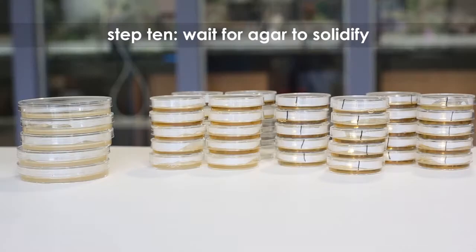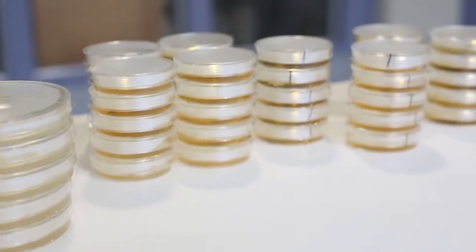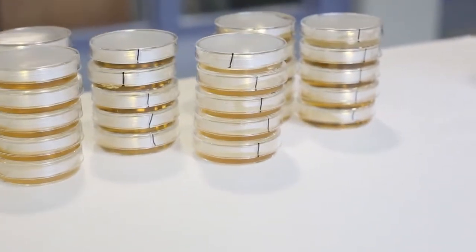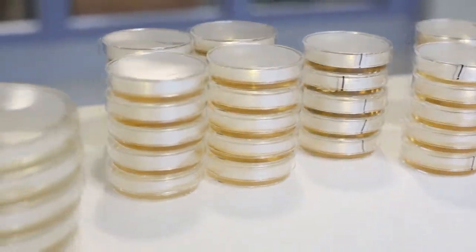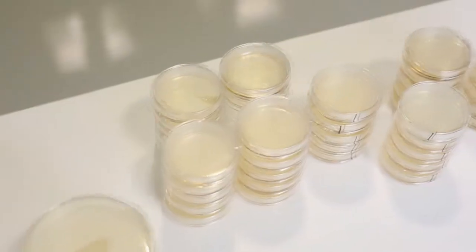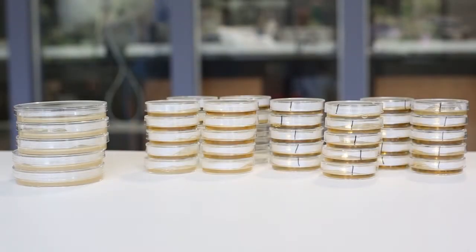Step 10: Wait at least 20 minutes for the LB agar to solidify. For optimal results, leave the plates at room temperature overnight. If the plates need to be stored, they should be inverted and placed in a sealable plastic bag to ensure that they don't dry out. The plates should not be stored at room temperature for more than two days.